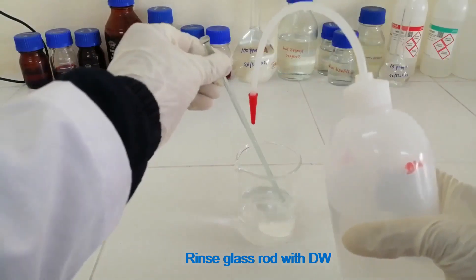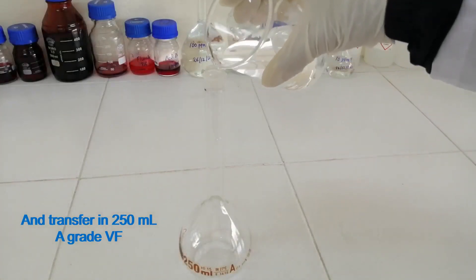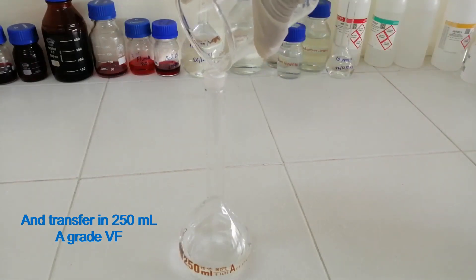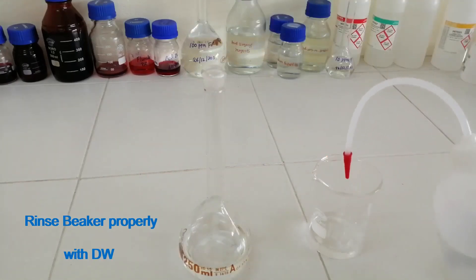Rinse the glass rod with distilled water and transfer the solution into a 250 ml A-grade volumetric flask. Rinse the beaker properly with distilled water.